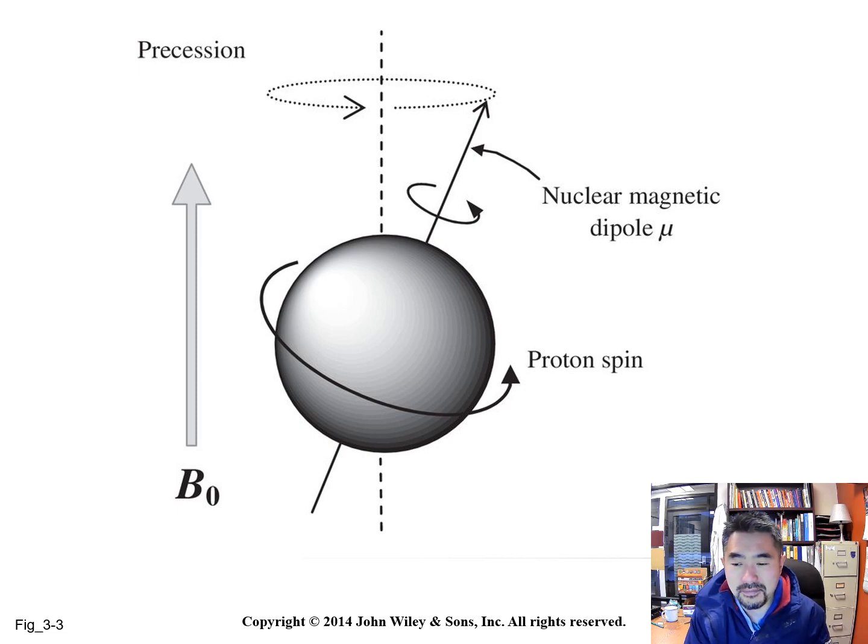So anyway, for the first day of our advanced spec class, I just want to introduce the class to you. The routine is going to be that we meet for a pre-lab lecture, at least for the first 10 weeks or so, because this is a hands-on class. You're going to elucidate the structure of a bunch of compounds, two physical unknown compounds in particular. The first one is not that difficult. The second one might be a little more difficult.